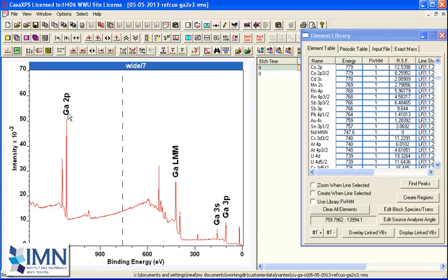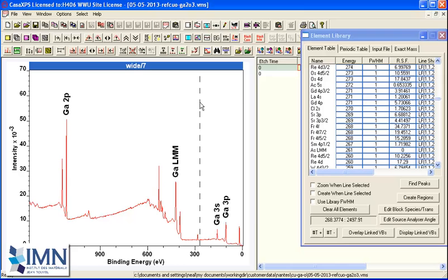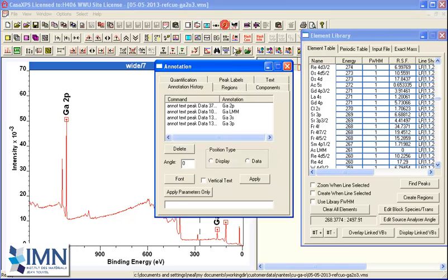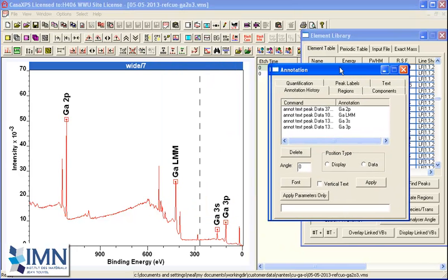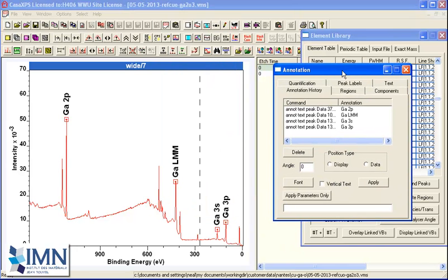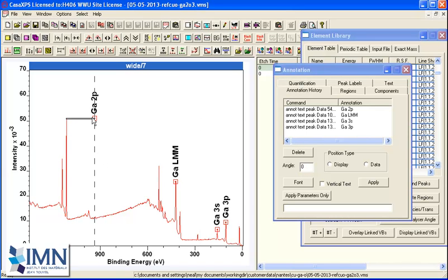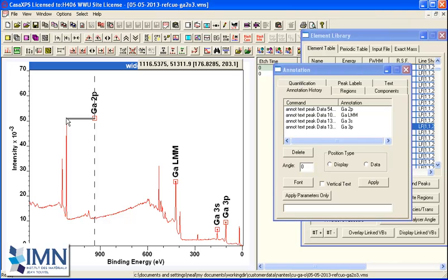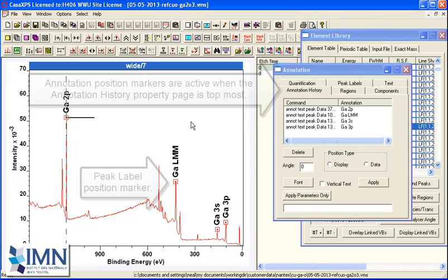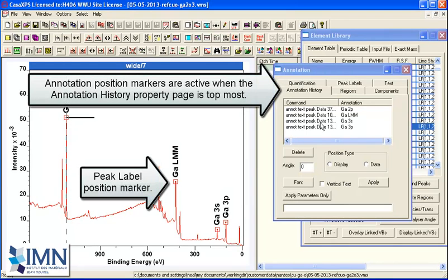The four labels were created as part of that peak labels property page and these then appear in the scroll list on the annotation history. When I go to the annotation history, you can see there's a box that allows me to drag and position it using the cursor.